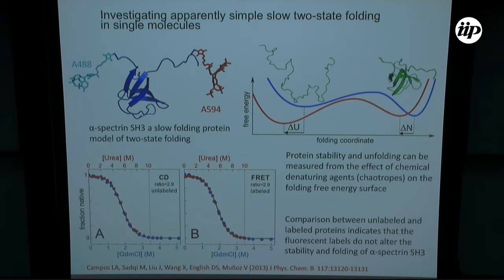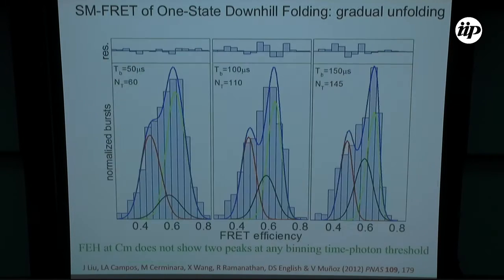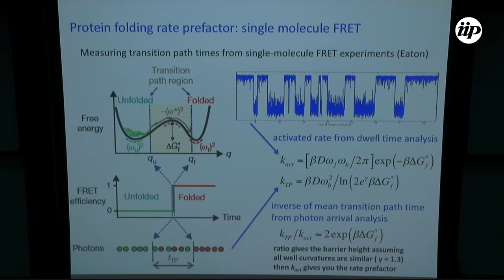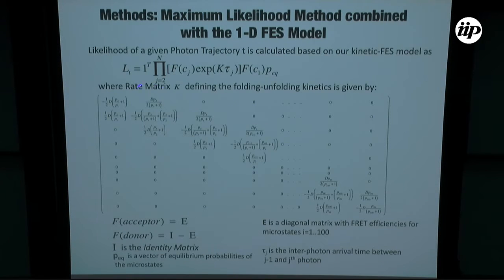It's only one for all of them. It's a constant transition, diffusion coefficient. Yeah, so this diffusion coefficient is the same for all of them. It's just one parameter. And that parameter is picked from the data because the idea is that the time between photons is relatively short compared to the dynamics of the process.